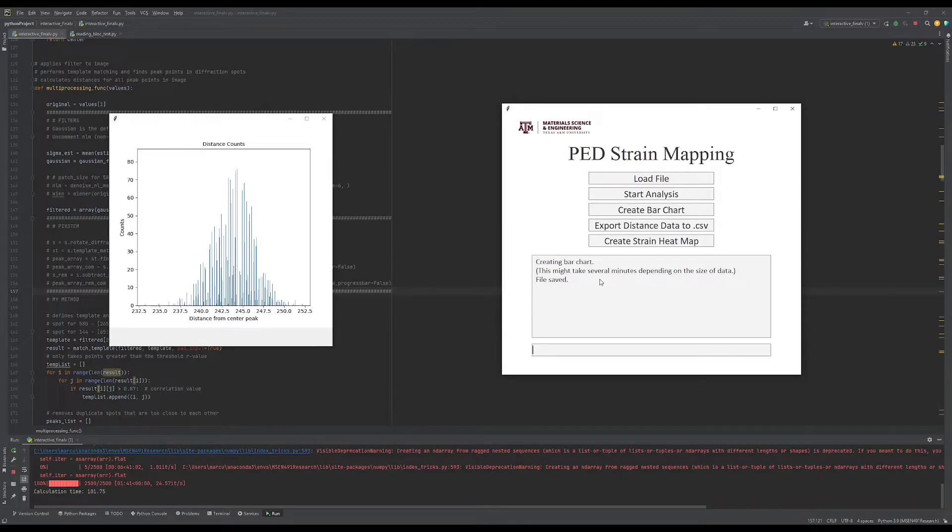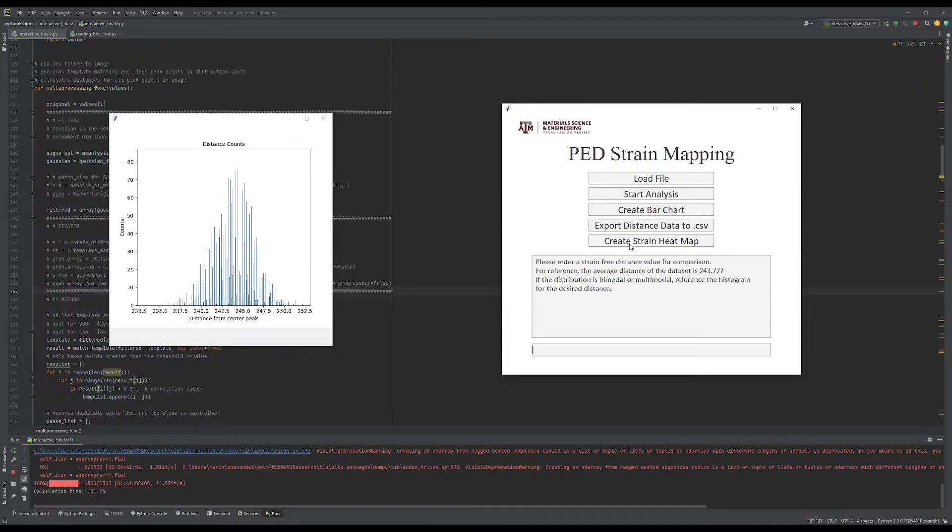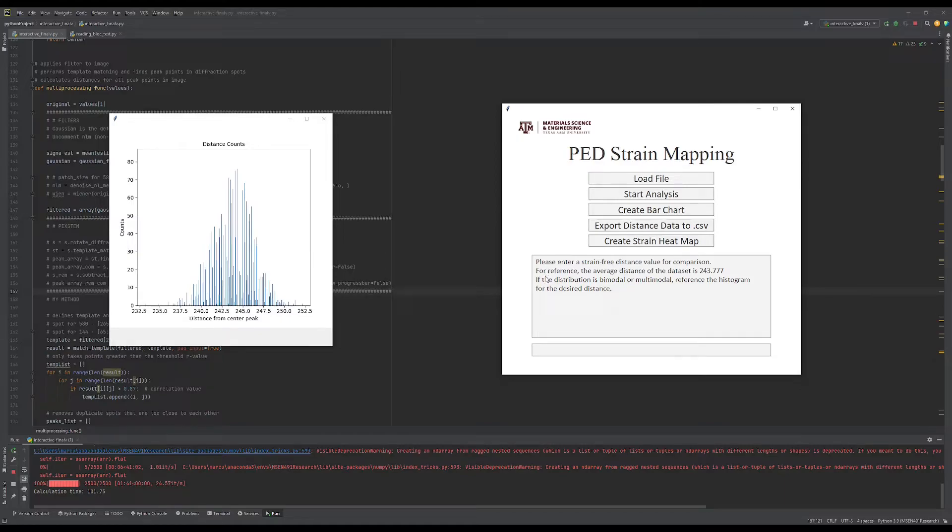Finally, we can create a strain heat map using the distance data and an entered reference distance. From the bar chart, we can see that our distance data is unimodal and a simple average of the distances should be sufficient. I'll enter the average distance of the data set and press Enter.